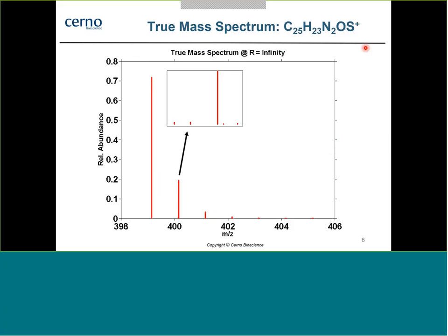For example, under the A1 cluster here, one actually sees multiple isobars, indicating the presence of, for example, C13, nitrogen 15, sulfur 33, deuterium, oxygen 17. And this provides really key elemental composition information that is going to be lost with your typical centroiding that's done in mass spectrometry.